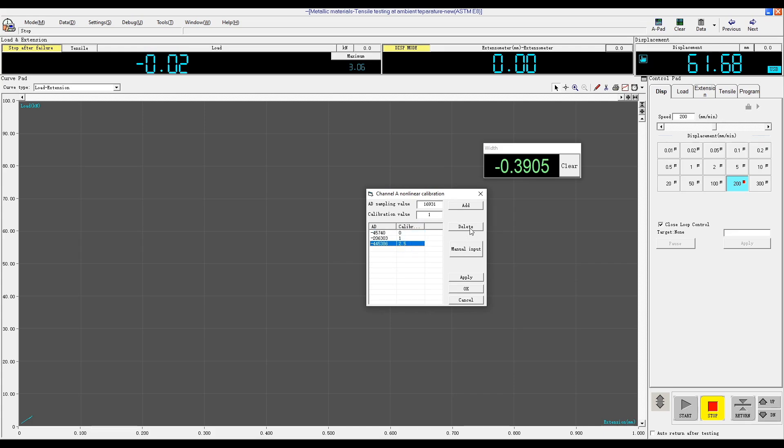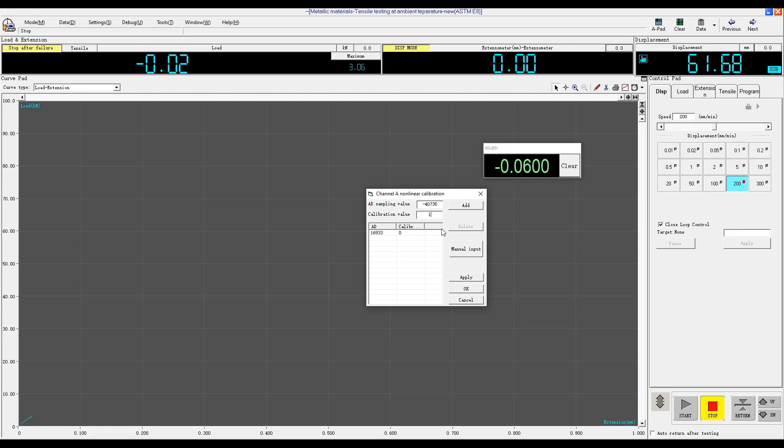In the software, you will see a window for the transverse extensometer. Right-click the window and select Channel A Calibration. Here you will see that calibrations have been conducted for 0 millimeters, 1 millimeter, and 2.5 millimeters, each with its corresponding sampling value. When calibrating for the first time, you may delete all existing values.